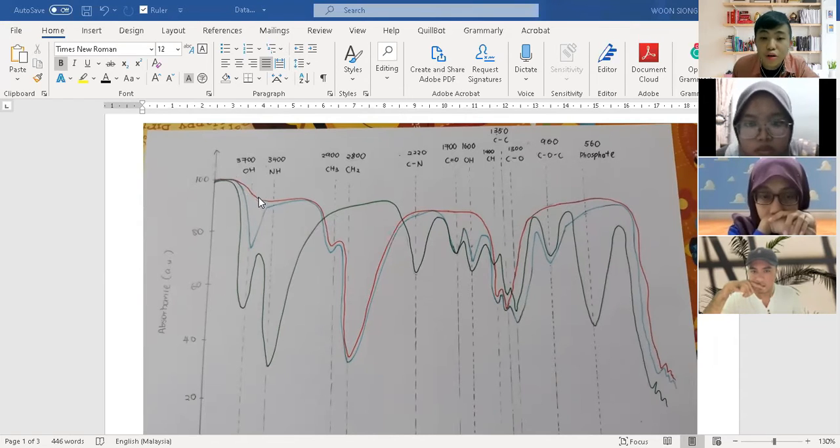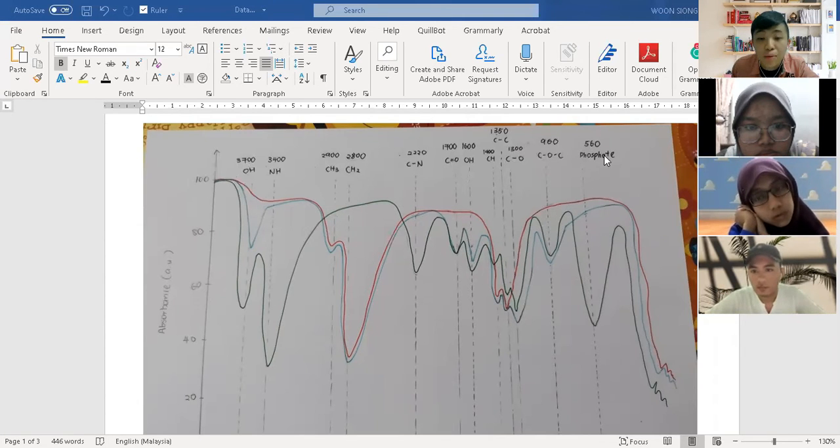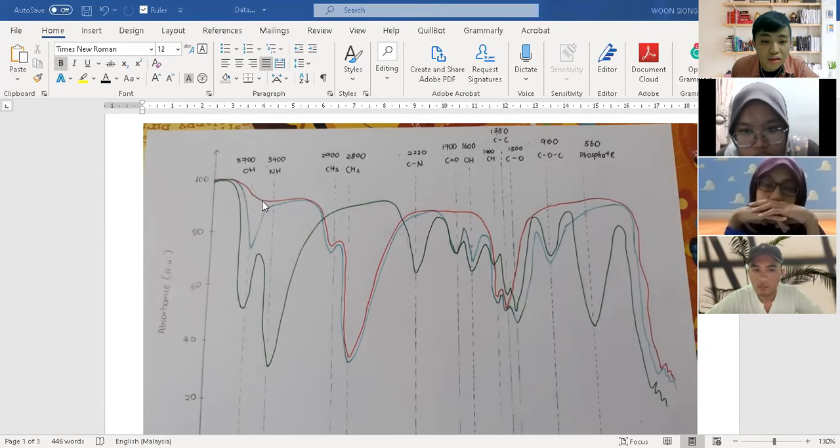It will release the H or the electron, and then it will attach to the phosphate group at the mRNA, so that we can see after the attachment, which is the red color line, the attachment of lipid nanoparticles with the mRNA. The ester bond and also the OH bond will be gone, maybe inhibited, because they attach to the mRNA. They are no longer free.